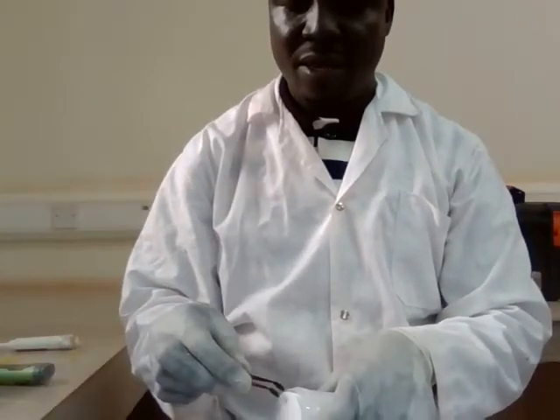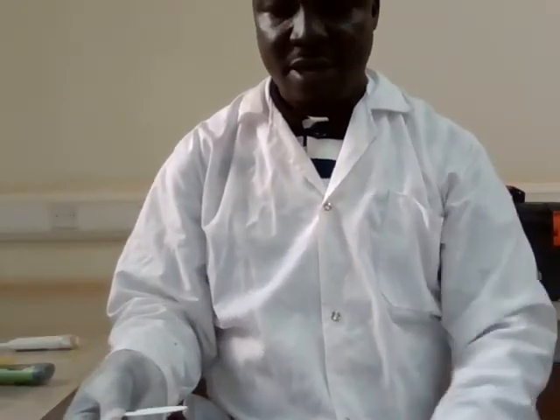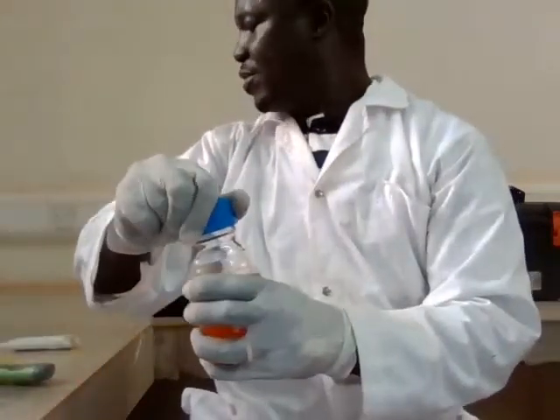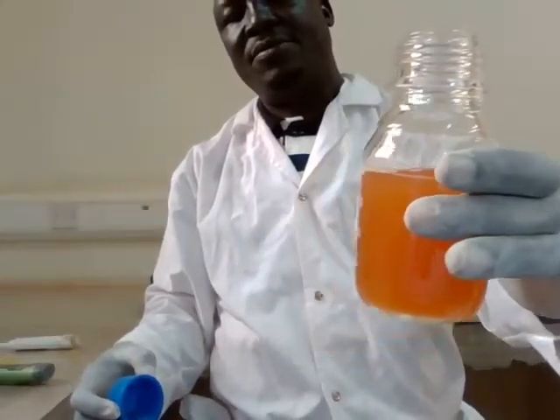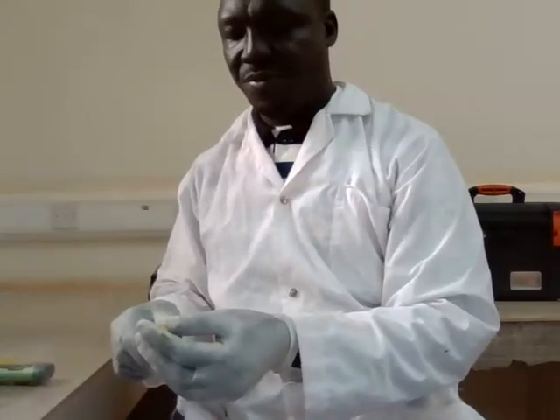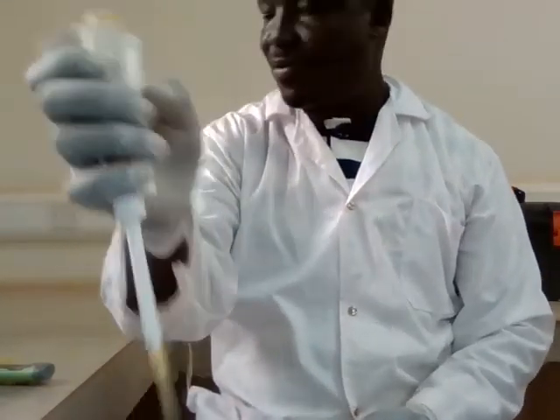Pick one sterile pad and place it. You have dispense. This is not sterile, but you need to prepare a fresh one. This is an old stock. Then you will get 3 mils. You can use this pipette, but that's a very small volume.